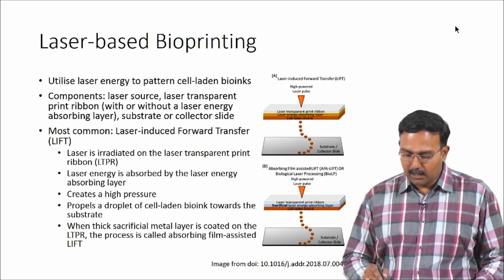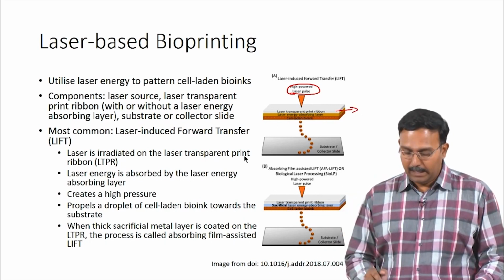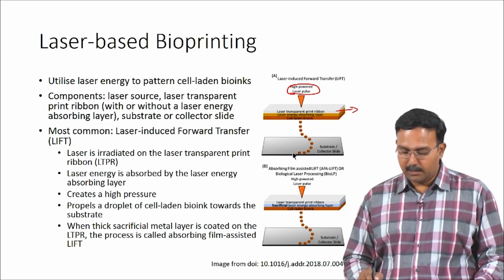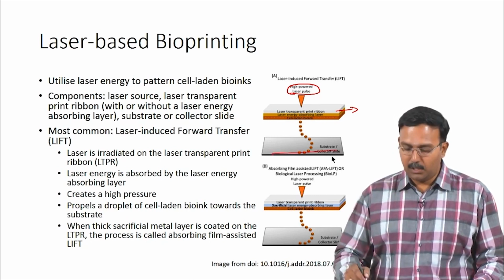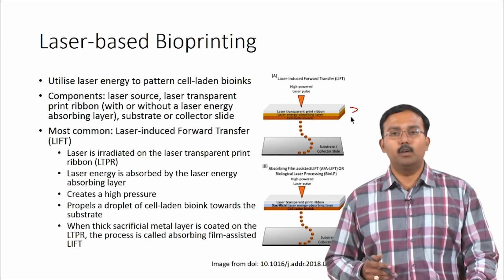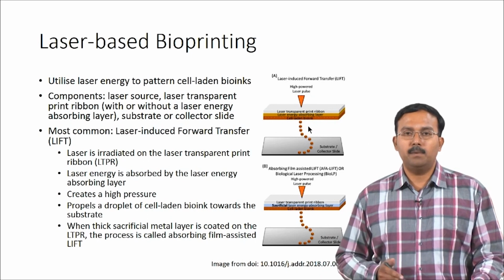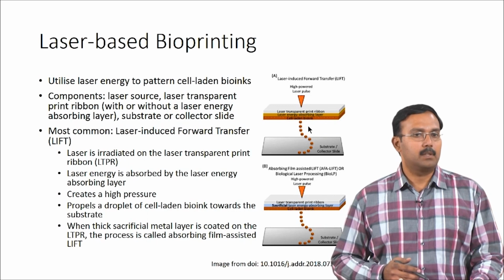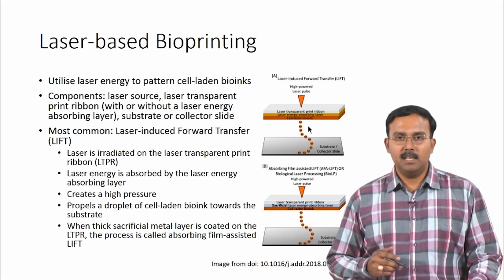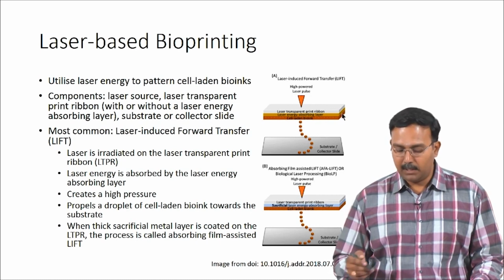This would be the laser source, and you have the ribbon on which the ink is laid, and then the substrate, on which the printed ink will fall. This is what you see in a laser based bioprinter. The most common technique used in laser based bioprinting is laser induced forward transfer, or LIFT. Here, laser is irradiated on the laser transparent print ribbon.